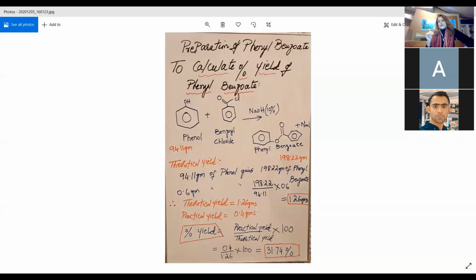After you have this pure form of crystals, you feel a bit happy, a bit successful, that yes, you have your product, and it's recrystallized also. Now you are going to record the melting point. The principle is that whenever you go through any organic synthesis, you must record the temperature before recrystallization and after recrystallization, and monitor the difference, each with a date.